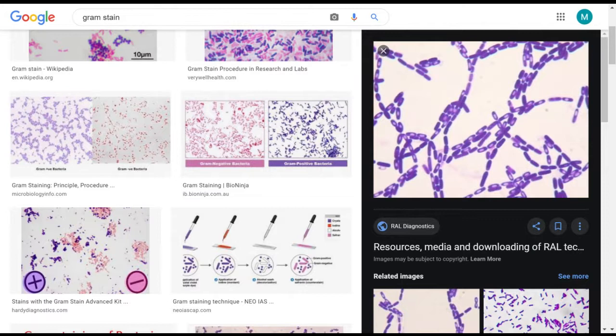But you can see how it hasn't been stained because the crystal violet is not all the way through it. You can see that clear stuff in the middle of the cell, which is the endospore. And it may have a little bit of a stain because these endospores are inside cells, so they're not finished yet. So they don't have the tough coverings that it would have otherwise.